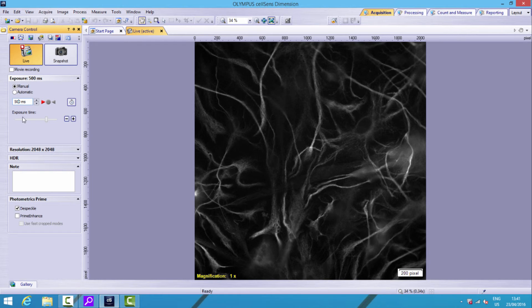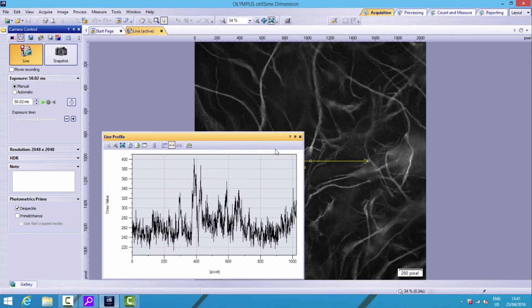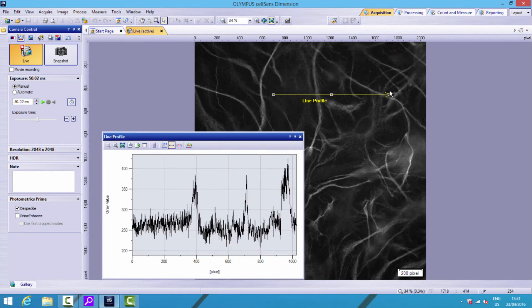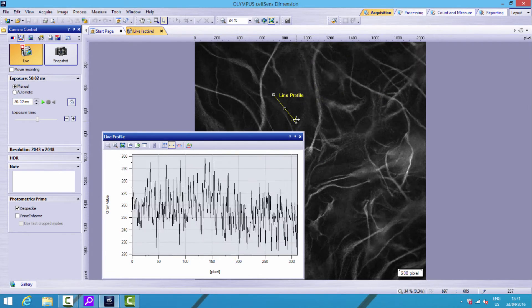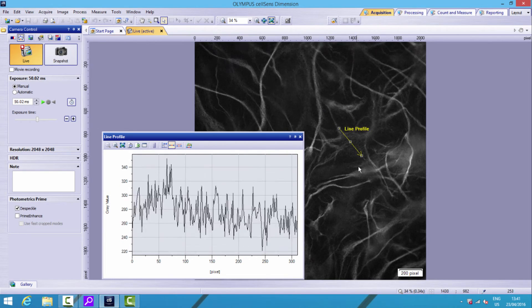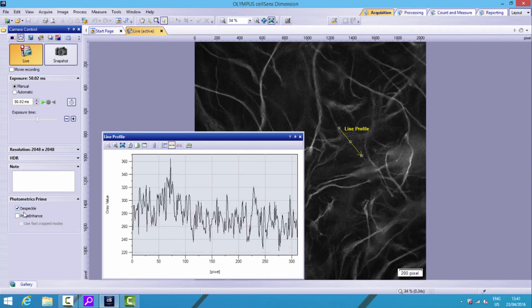So let's start off by reducing this. We want to go to 50 milliseconds. That's much more like it. We can see the noise there. Majority of that is shot noise. Let's put a line profile on. It's a good way to show this. Put the line profile on, drag it over an area of structure.